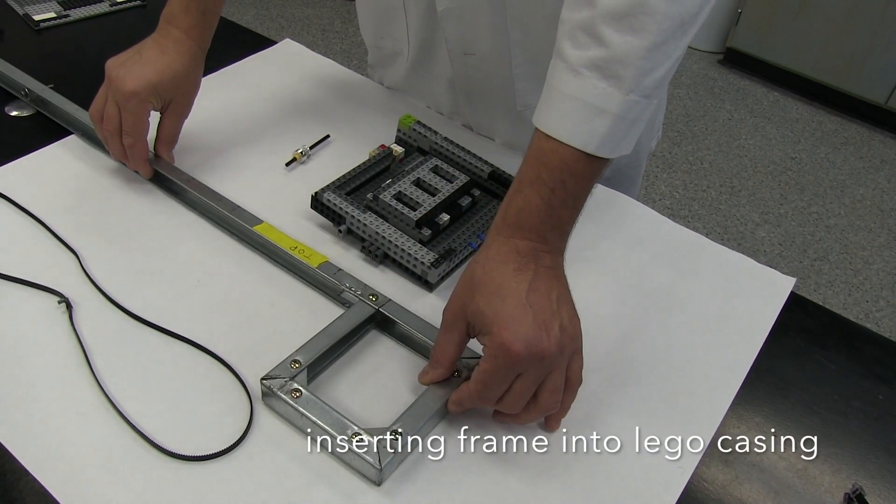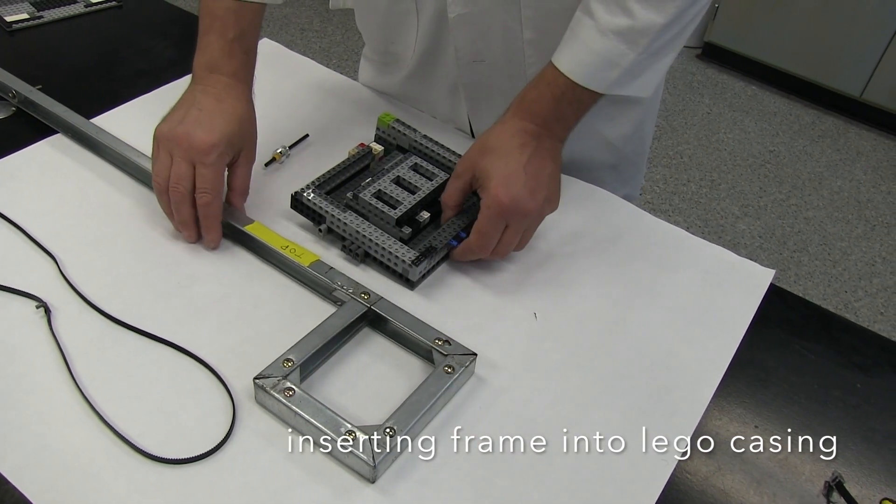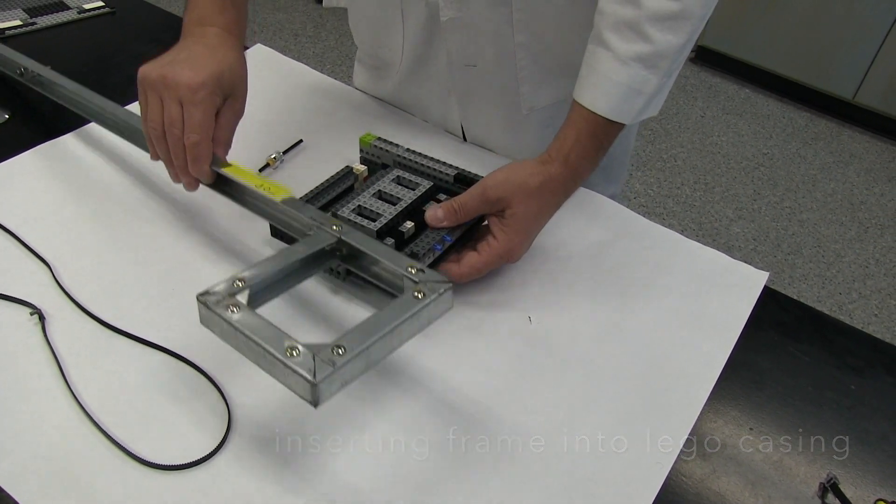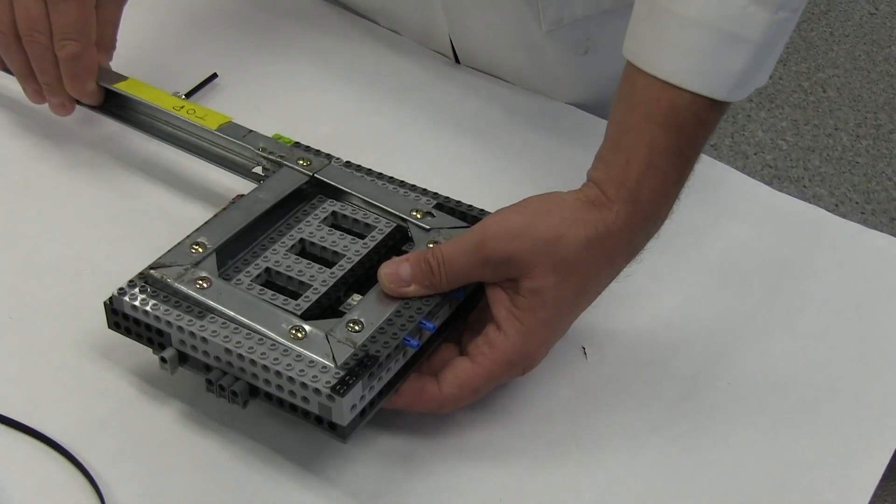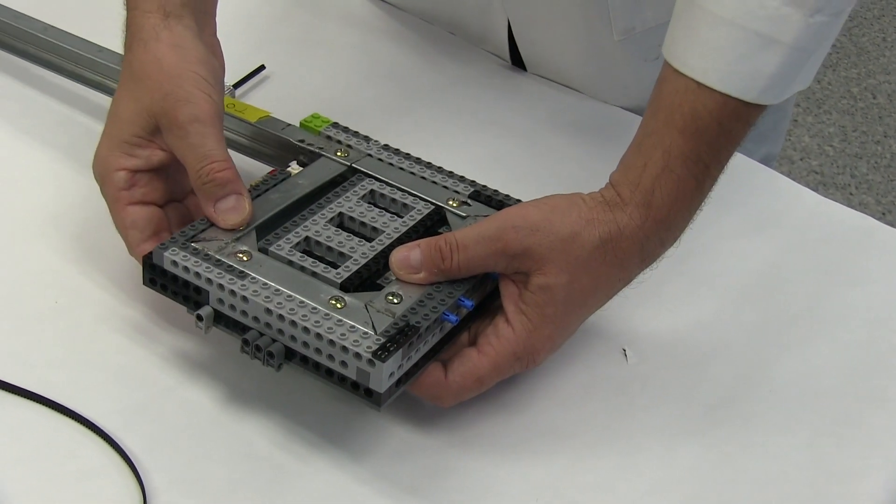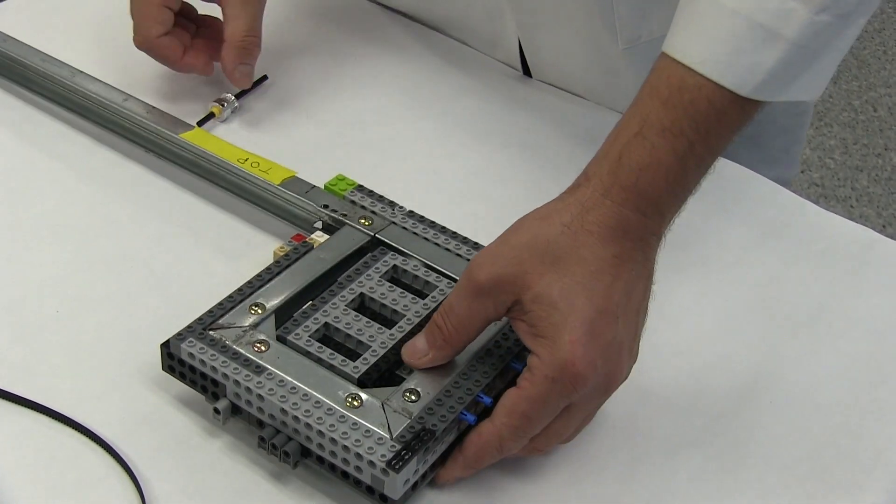In this next step, we will insert the metal frame into the Lego casing. Step by step instructions on how to create the Lego casing setup are provided as a supplementary file to the companion publication for this robotic system.